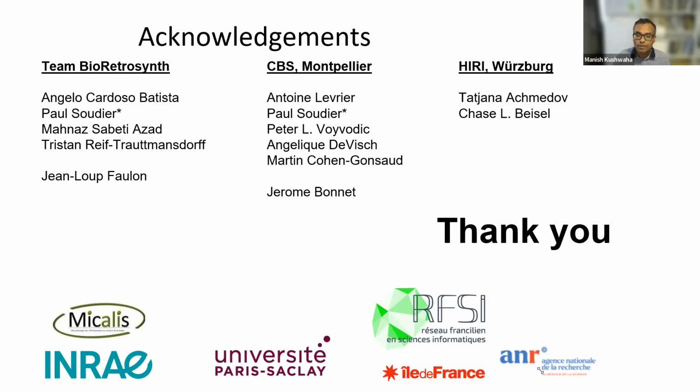I can't share specific examples, but there is minimally a molar relationship between linear DNA length and yield. Equal mass of two different length DNAs will result in less expression of the longer DNA because this molar quantity is reduced. Yes, so for all the data I presented today, when we make comparisons, we're always aiming for the same molarity. We never look at the concentration in nanograms per microliter. So you're right, of course, if the molarity of the DNA is lower, then you have fewer templates of this DNA, so you will have a lower yield.